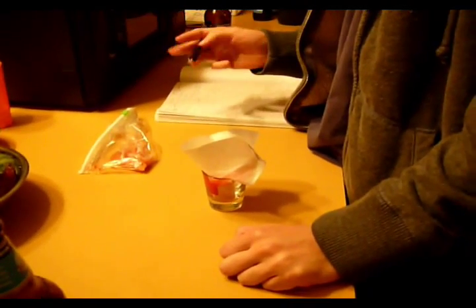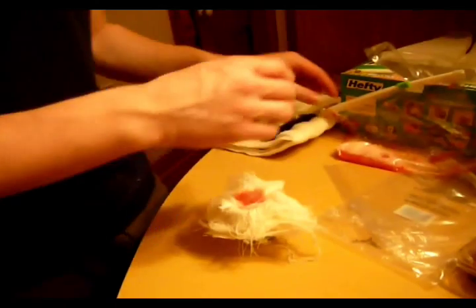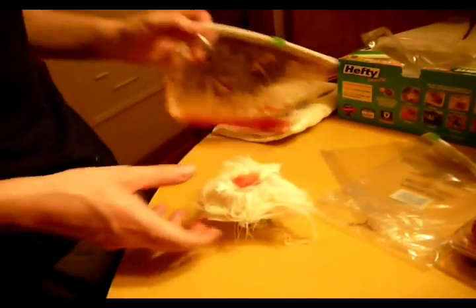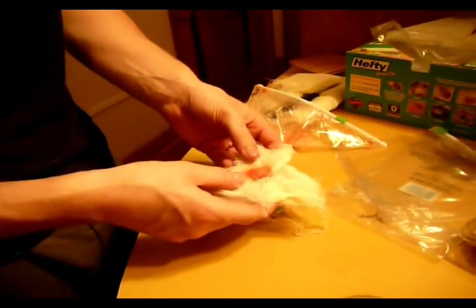You're doing your own experiments over there. Anya, you might have to be the documentarian too. I think so — we're all amateurs here. That's cheesecloth, like four layers of cheesecloth. Or like 18 layers.